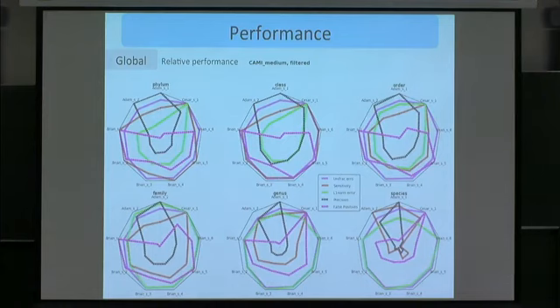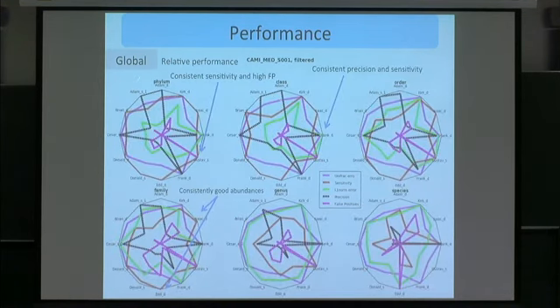If you pooled everything together, so take all 4 of the medium samples and pool them together. So Adam, Brian, and Caesar were 3 participants that did this. And this is the sort of thing that you can get. And you can see that the precision is, or Adam is a precise guy, which Adam was precise up here as well.